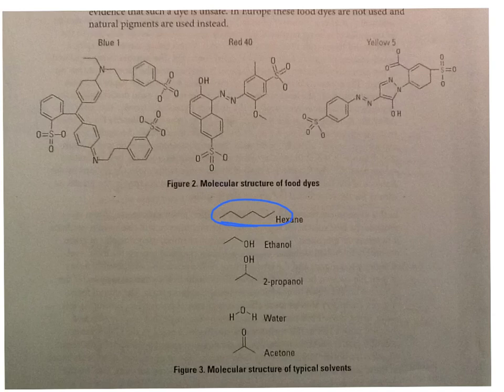Alright, which would make sense why, if these compounds here, they like water because they can hydrogen bond with the water molecule. So that's why you're going to also see that we get separation with ethanol and propanol. But what you want to notice is that we didn't see as great of separation with water, and that's because ethanol's got not only the hydrophilic part, it's also got the hydrophobic part.